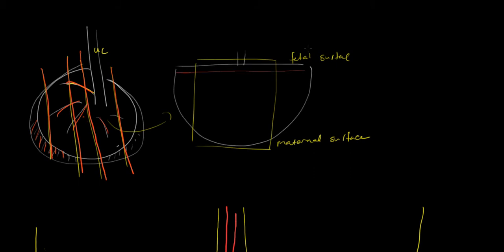Here's the fetal surface, this will be the chorionic plate, and this will be the lateral aspect of the placenta. The membranes would reflect up from here but they're usually not seen in continuity, and this will be the maternal surface of the placenta, or the deep aspect. And even the wedge will have a certain amount of thickness to it, depending on how thick one has taken their perpendicular sections.